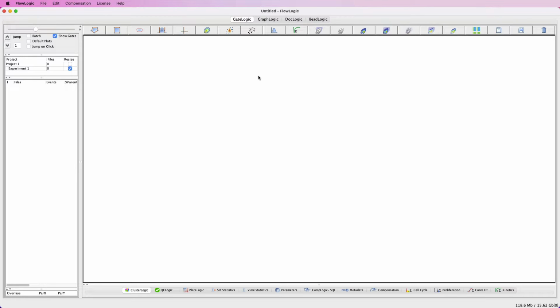Once again, an example, if you're working on your work computer, you quit FlowLogic, you go home for the day, and then you decide you want to use your license, but it is currently linked to a computer at work, you can log on to your online account, release the license remotely, and type in your username and start analyzing your work at home.